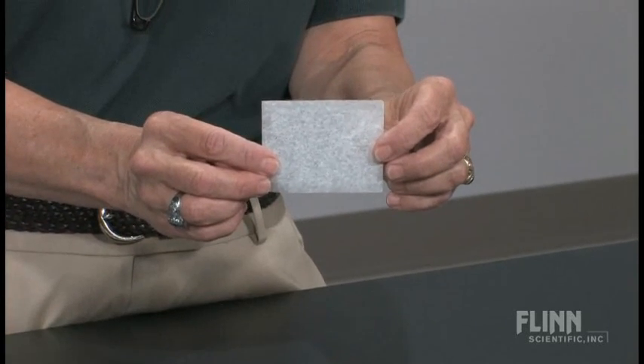I'm going to perform a demonstration that can actually be used in three different units. The first time I show it to my students is when I'm trying to make distinctions between physical and chemical changes. This is a difficult concept for some students, and what I do is I show them a piece of white paper and ask them to make observations.